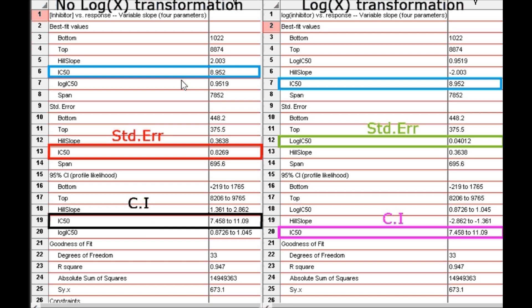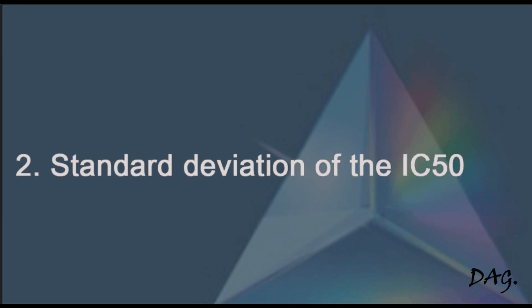Up to this point we've been able to find the IC50 value, the standard error of the IC50 value, as well as the confidence interval for the IC50 value. Next, we want to calculate the standard deviation of the IC50 value.